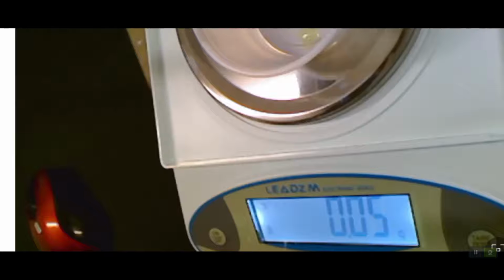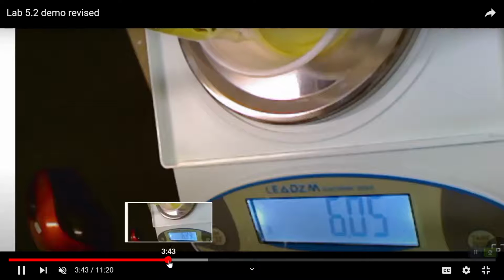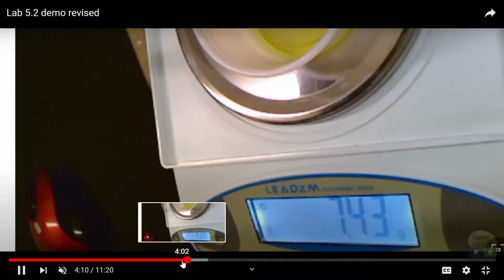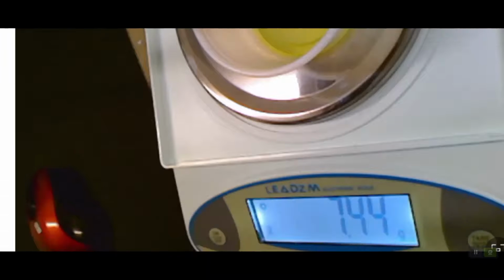I'm going to go all the way up to 7.5 grams, but you can just see the soap filling into the cup. You can't see the pipette, but I think you get the idea. All right, I'm going to fast forward that because all we really care about is our end game: we want about 7.5 grams. I think when I get it up there, I get to like 7.55 grams, and that's where I stop. And that will be the mass of the soap that I am going to add to my 500 ml volumetric flask.